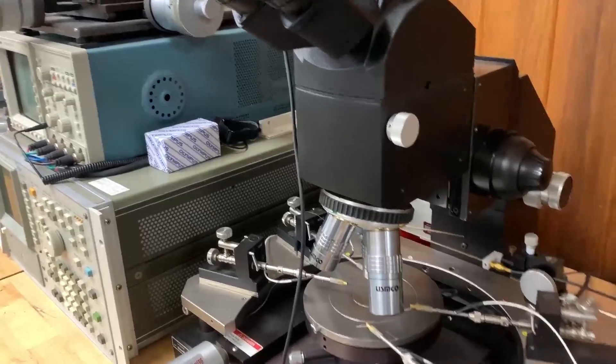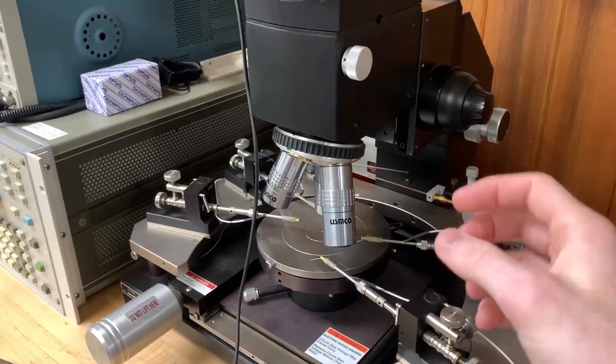You could build this like some kind of LED lamp and then a spectrometer.